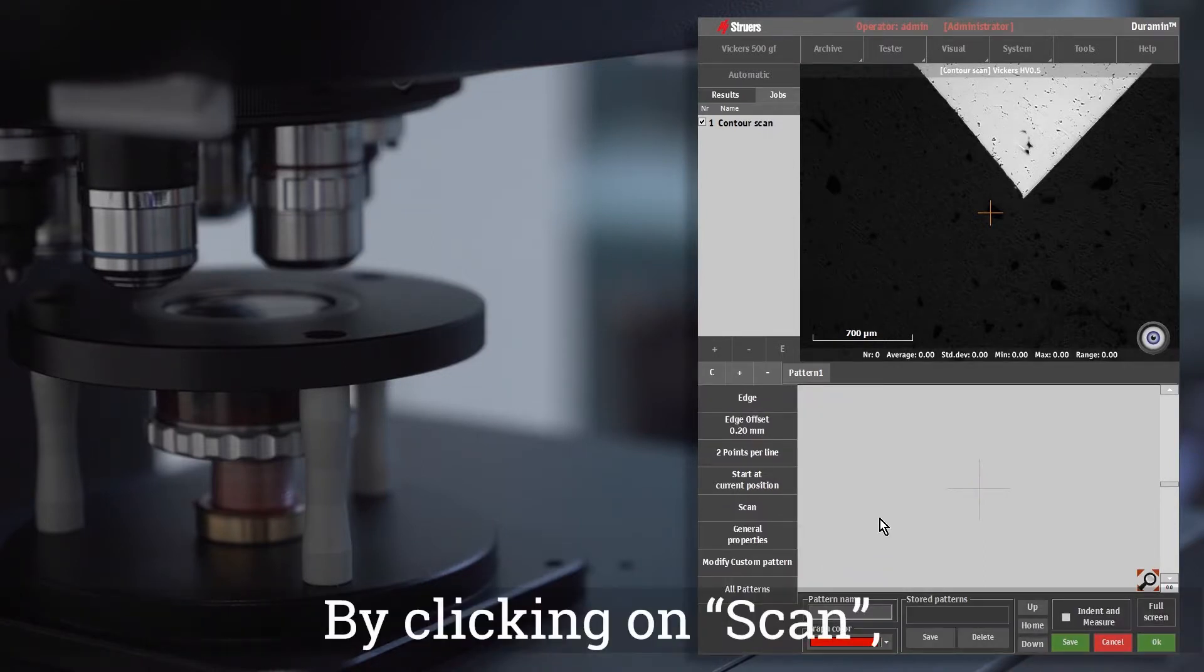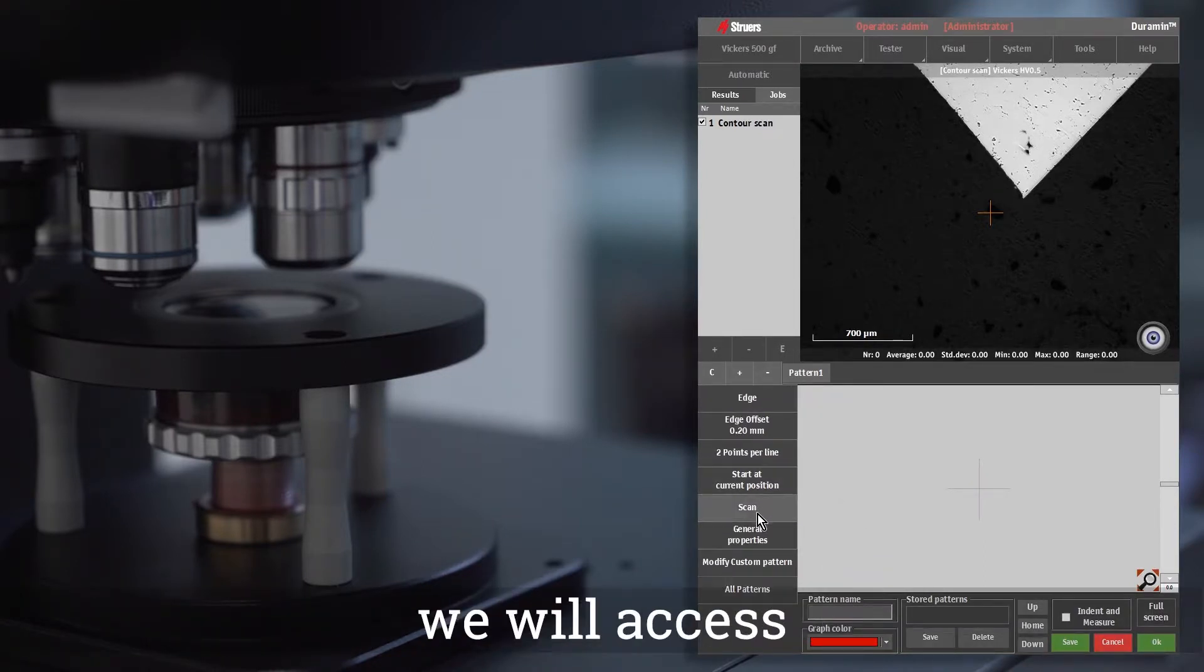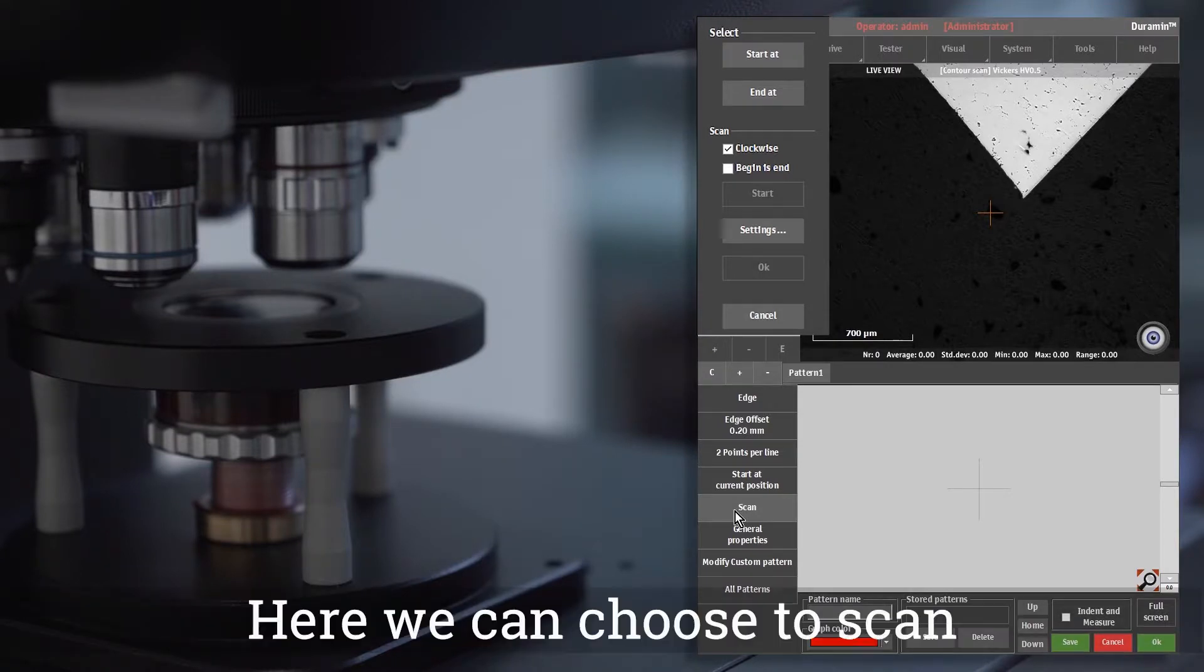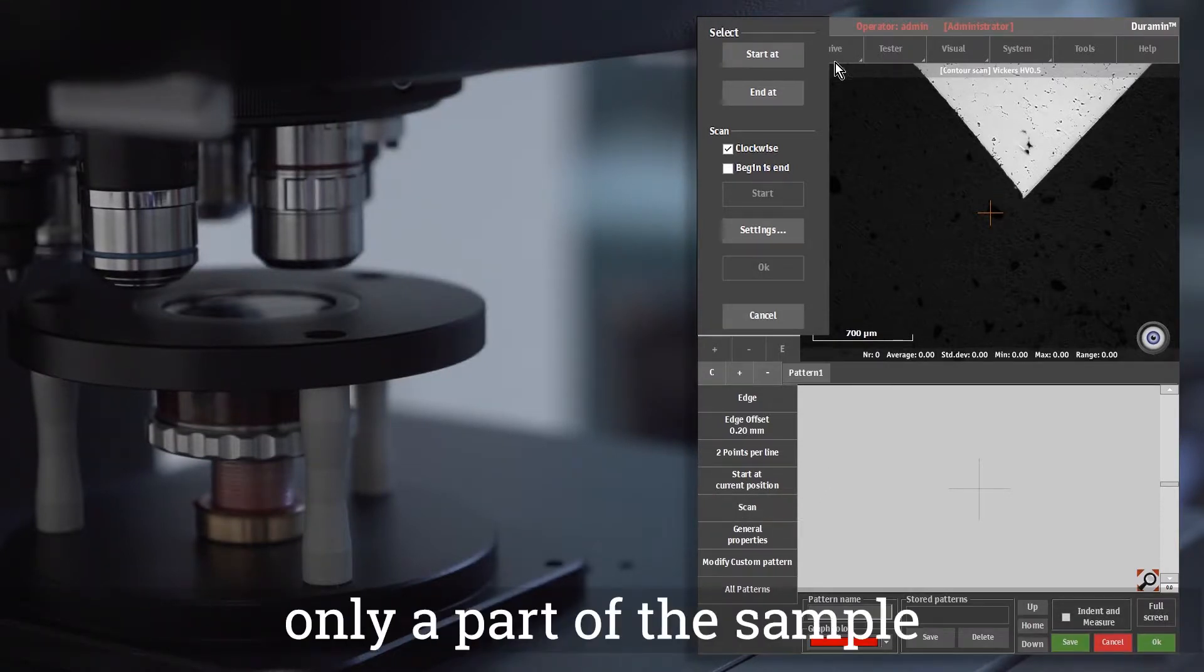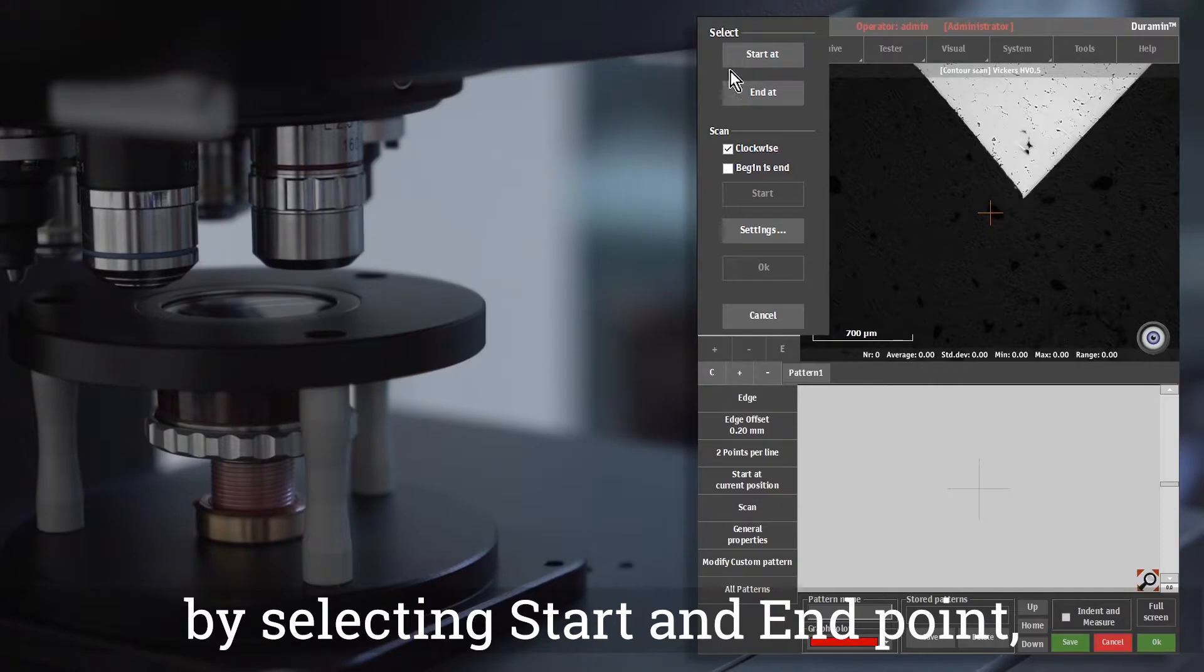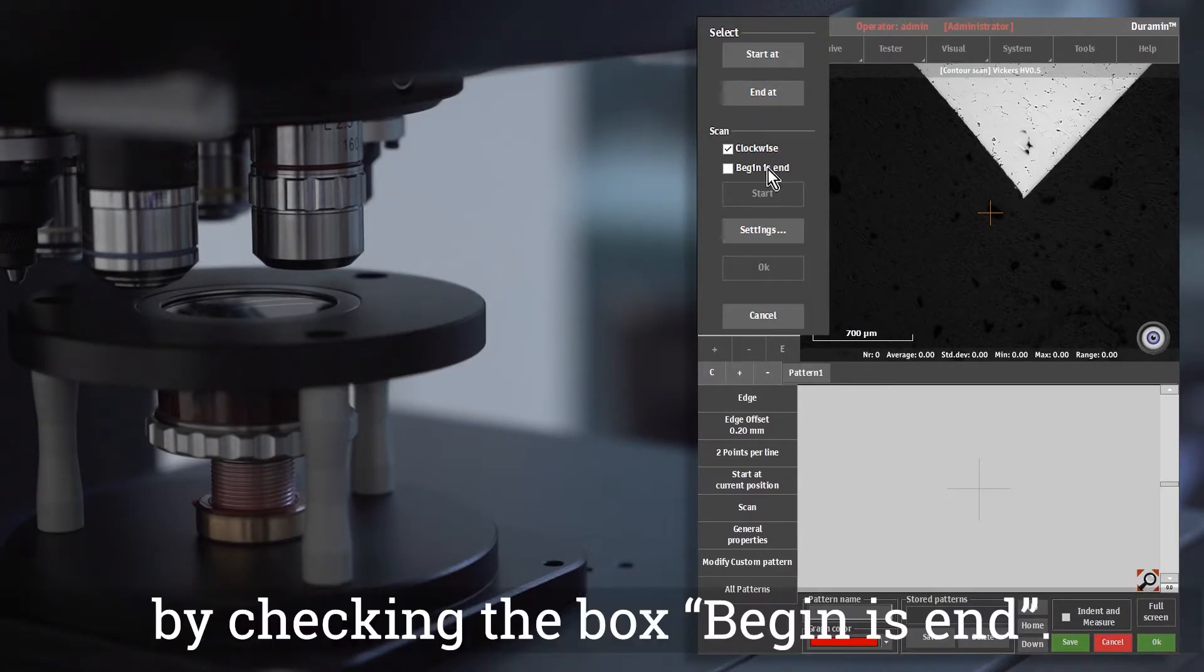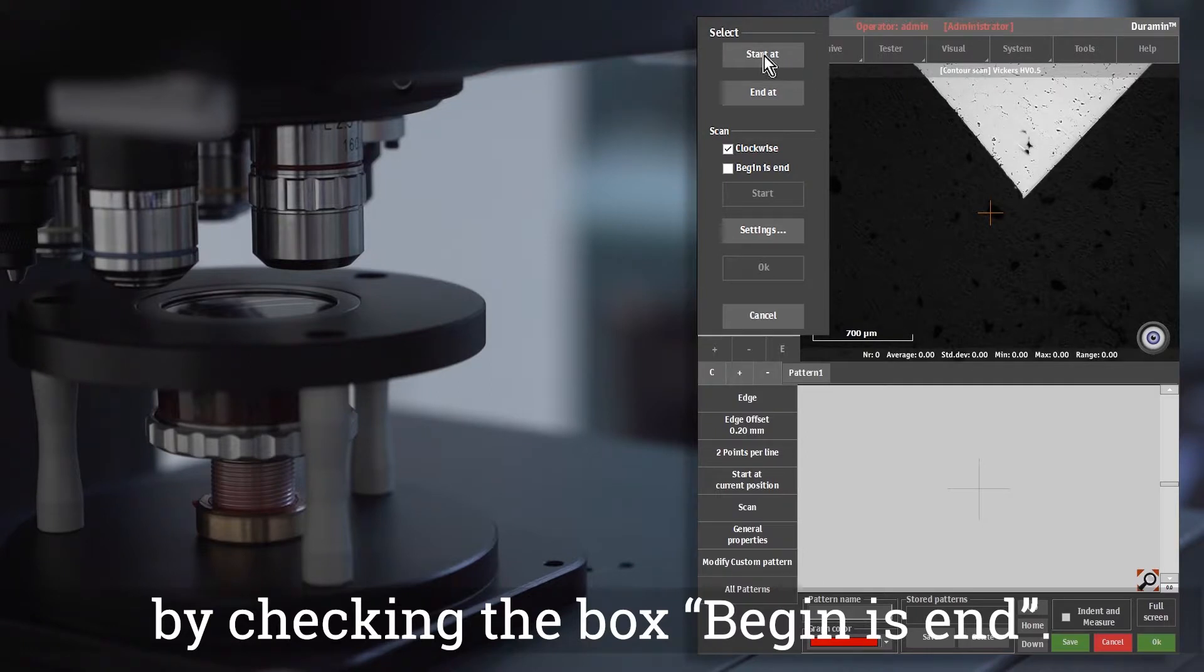By clicking on scan, we will access the contour scanning options. Here we can choose to scan only a part of the sample by selecting start and end point, or to scan the whole contour by checking the box begin is end.